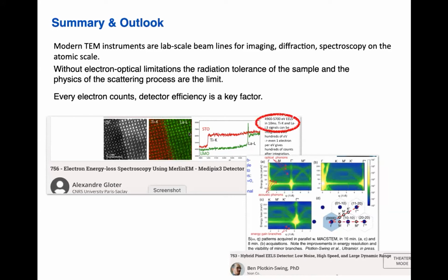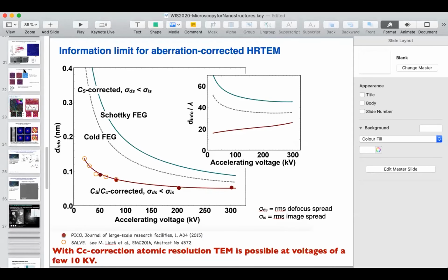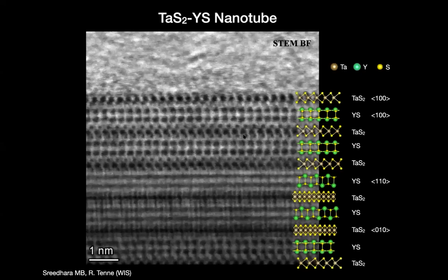Yes, it's possible. If you go back to the slide that I showed for the nanotube, there it was pretty easy to see whether you have a prismatic coordination or a 1T coordination. So this would be the slide to show here. It's pretty clear that for the tantalum sulfide, you have a prismatic coordination and not a 1T coordination. And there are also literature examples which show nicely that you can discriminate between 1T and H or 3R.